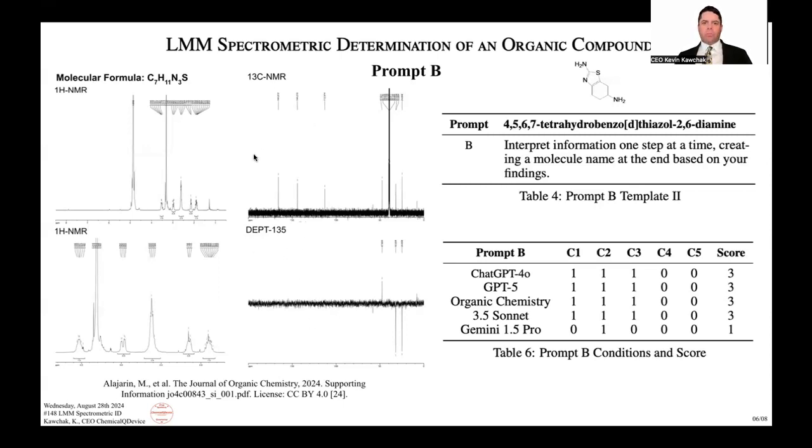Now, if I count these carbons here, 1, 2, 3, 4, 5, 6, I'm 1 short, because it's a C7H11, and I think that there's overlap in the CH2s. The ones that seem closest to me are probably these 2, because this is closest to amino, and this is close to that nitrogen as well. So there could be some overlap. But anyways, there's supposed to be 3 CH2 groups, and then we see those 2, so potentially overlapping on one of those. These chemical environments aren't too drastically different. But this one should be, because of the sulfur right there.